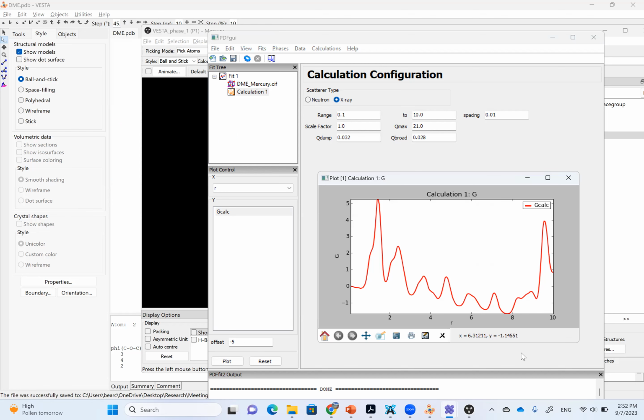There's something kind of weird here, right? So what is weird about this PDF data? The baseline. Why do you think the baseline is weird? It's going up and down. That's true. The typical baseline should be just one slope, right? But this one looks like it's kind of a curve. I think that relates to the presence of this peak, which is kind of strange. Oh, that's not a real peak. Yes, this is not a real peak, right?